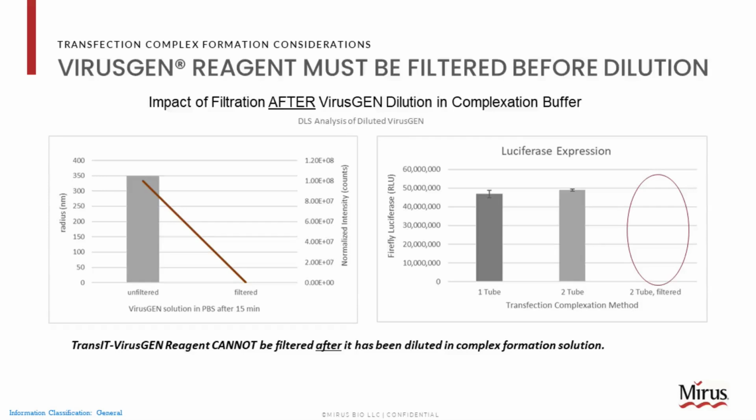We do need to keep in mind, though, that once our reagent finds DNA, it will start to complex it. Those particles will start to increase in size, growing larger over time. While the individual components can be filter sterilized into the complexation vessel without issue, once they've met each other, we are now in a closed system. So keeping in mind that our initial formation can be open to close via filter sterilization, from the point that we start the complexation, we are going to be in a closed system. So this means working with welding, aseptic connectors, and things of that nature.